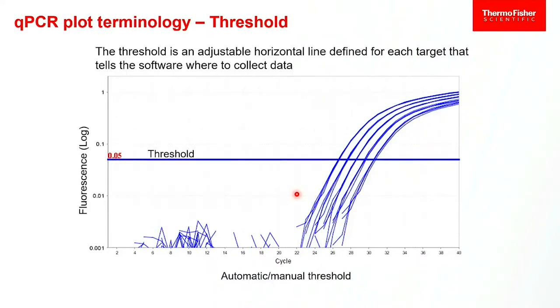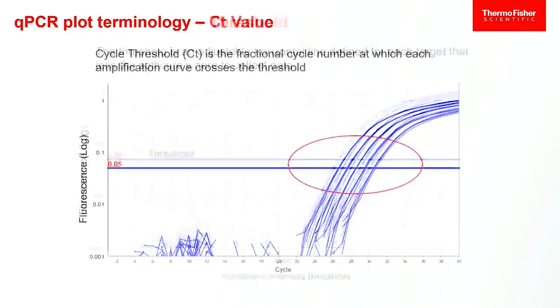Yes. It's one reaction tube. Typically, when we run gene expression, we want to have 3 runs of exactly the same thing. That allows us to do some averaging, outlier elimination. So if you think maybe one of them is bad, you can throw it out and you still have good data. Or you have an average, which means you get error bars. Error bars are great. People shy away from them, but statistical confidence.